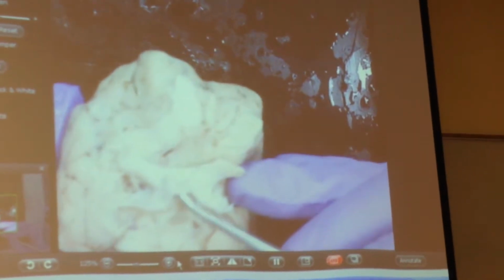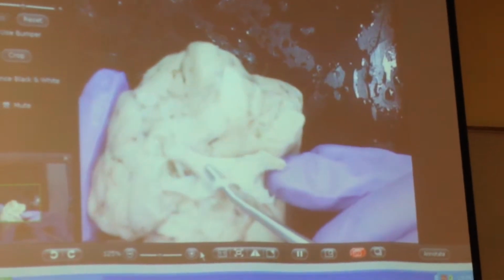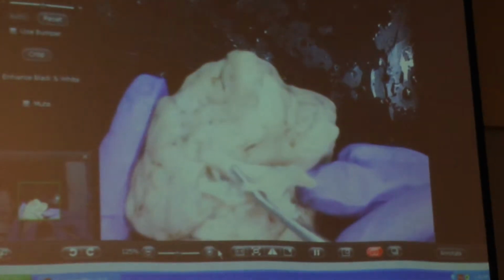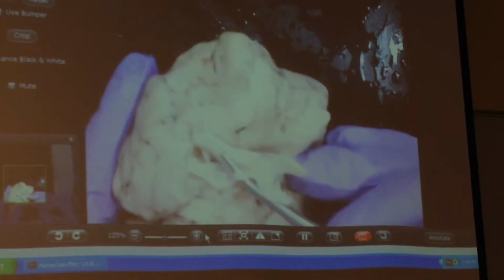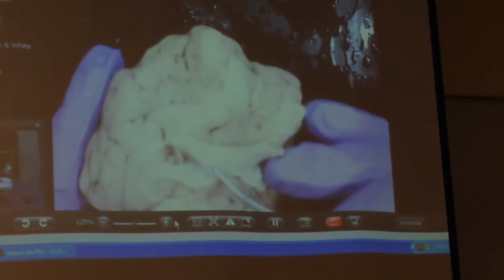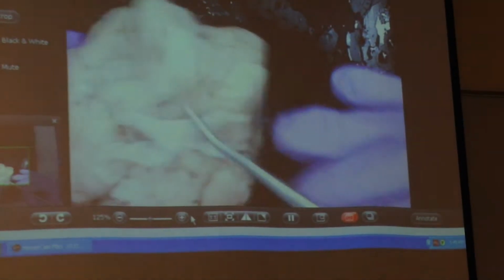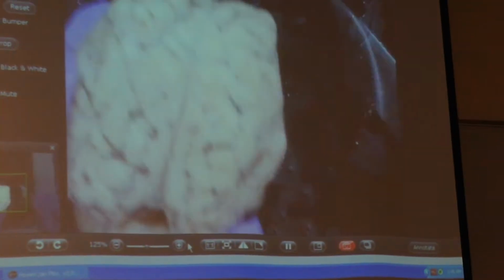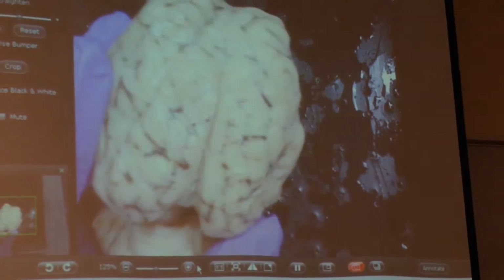Can you see it, this kind of white color? It has the consistency of the shell of a shrimp. Those of you that like to eat shrimp and maybe have peeled shrimp, that's what the dura mater is, that top. So it's all of this white that you see on here. The rest of this brain that we're looking at right now does not have any dura mater on it.